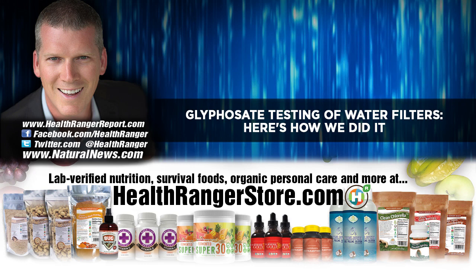But then somebody gave us a hint about another column that was a custom-made column, some kind of hybrid chemistry, which to this day, I don't quite understand all the chemistry of it, because you have to have like 20 years of experience to know what this chemistry is doing, to be a specialist in chromatography chemistry. That's a lifetime of study, basically. But what I know is that when you order one of these columns, you have to wait like 2 months to get it because they have to make it for you. It's not an off-the-shelf thing.